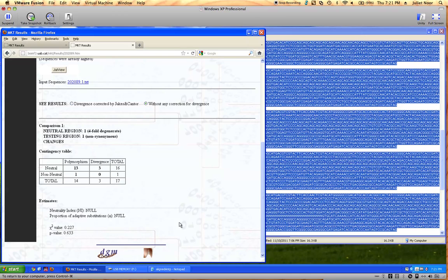That's the completion of running the McDonald-Kreitman test. You do all three of these steps for your five genes, then pick two of them to look up the function of the gene's product — as shown in the FlyBase video — and relate the function to your McDonald-Kreitman results.